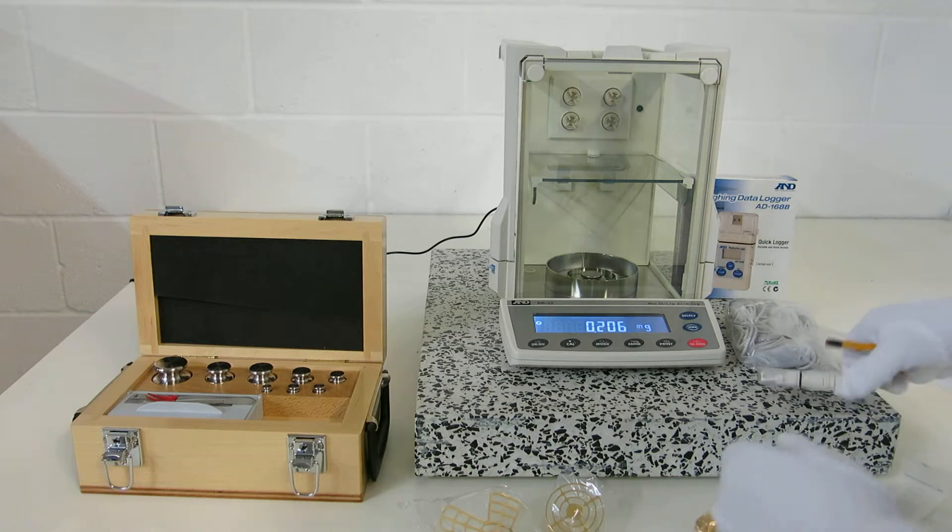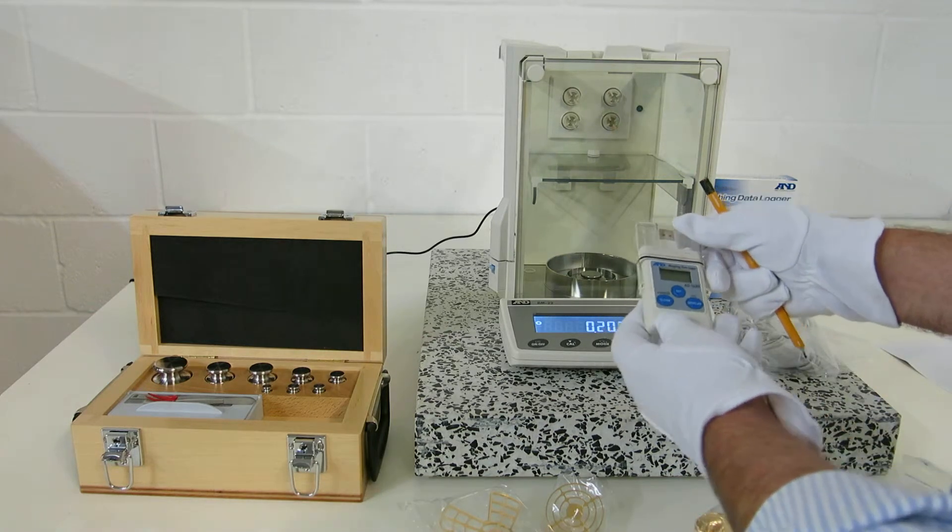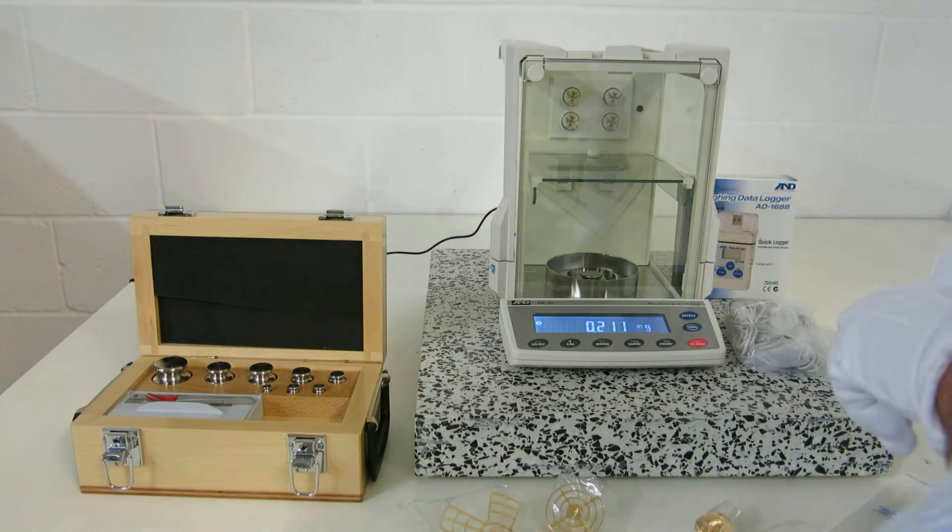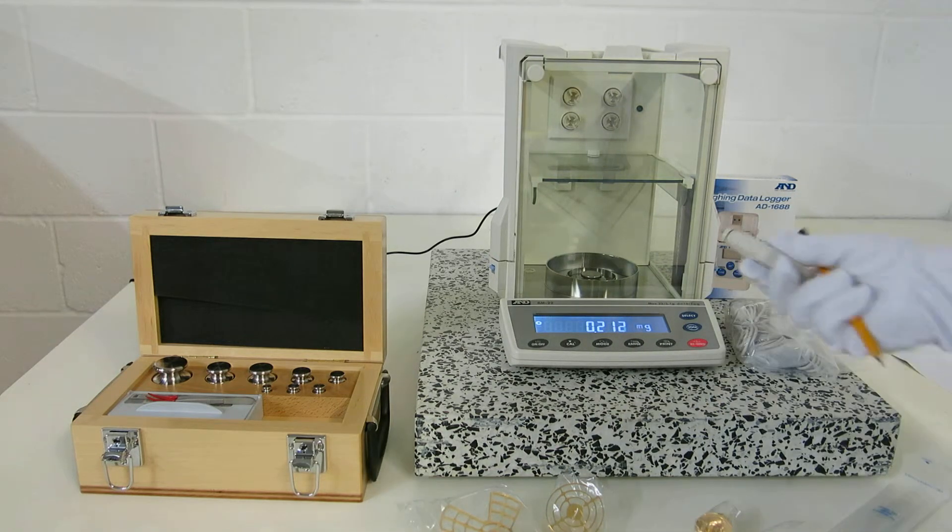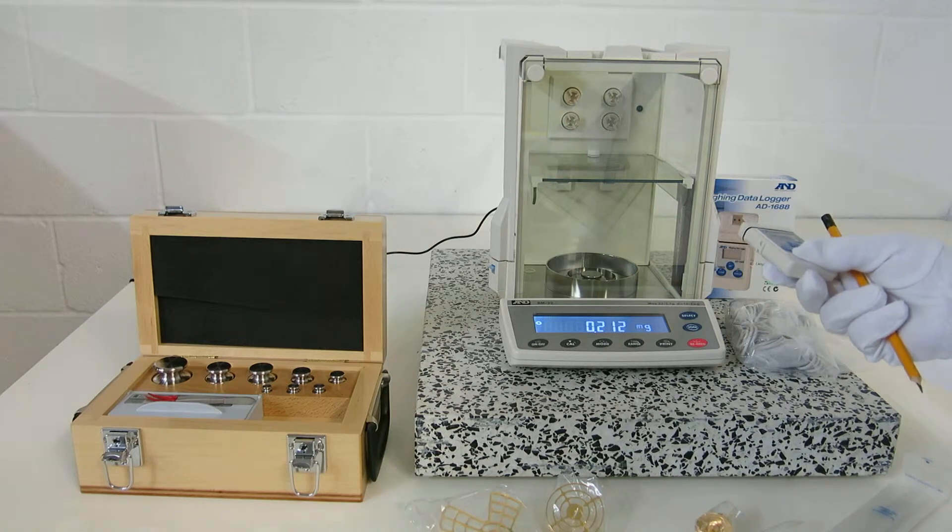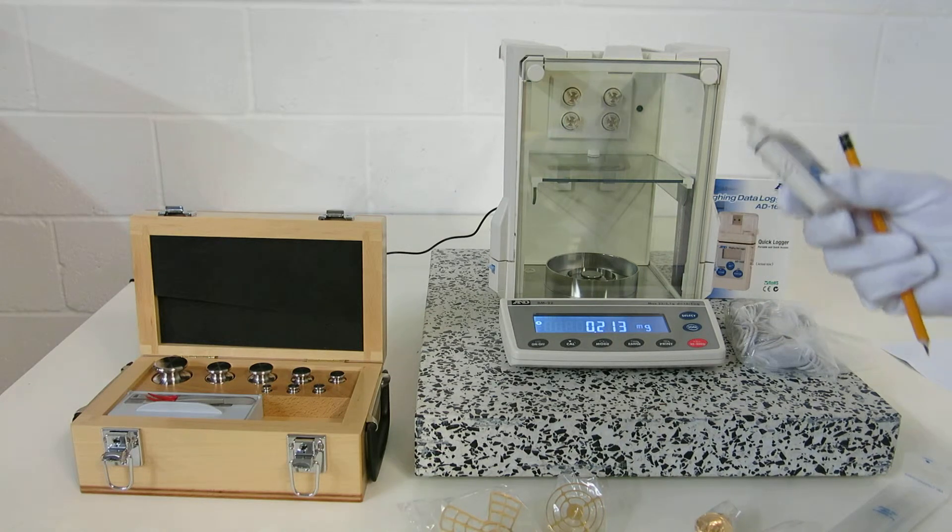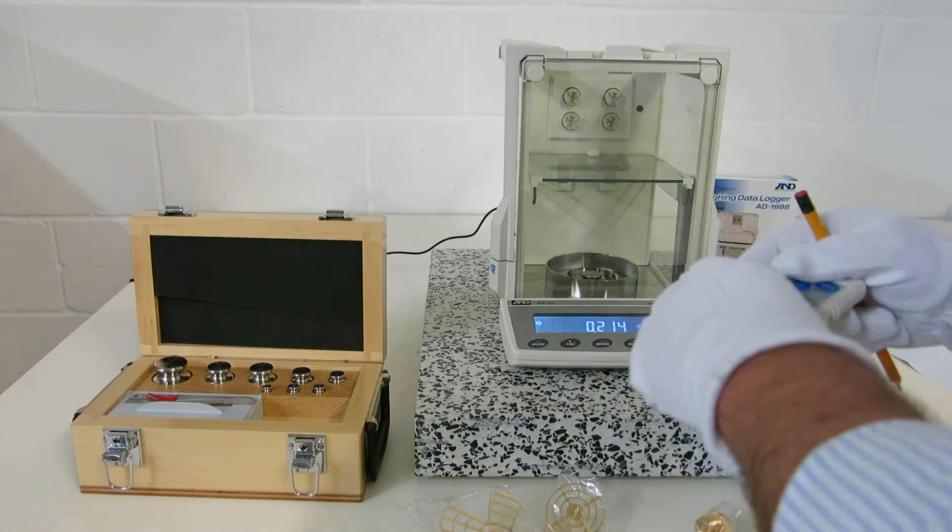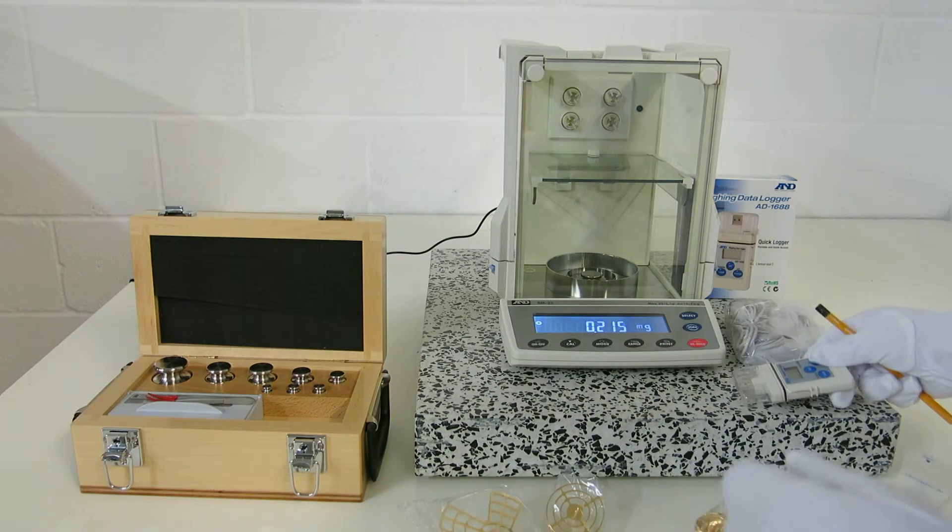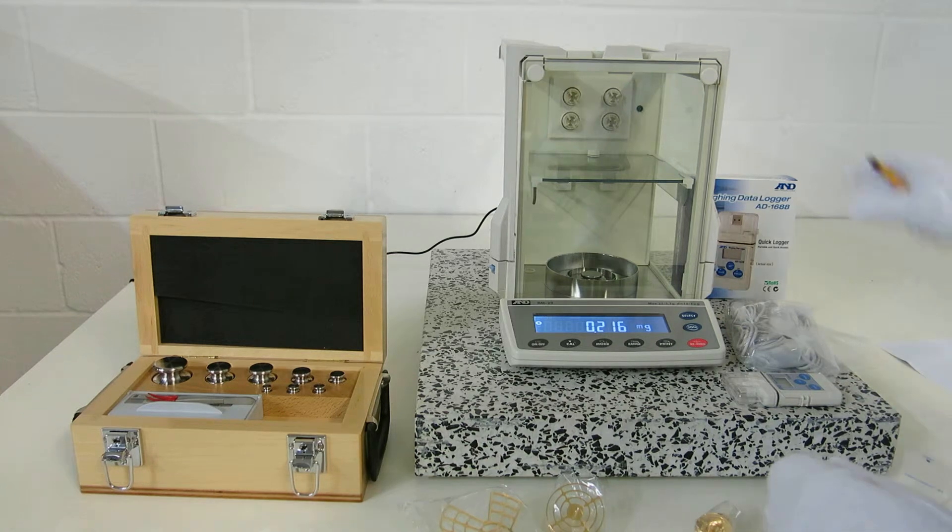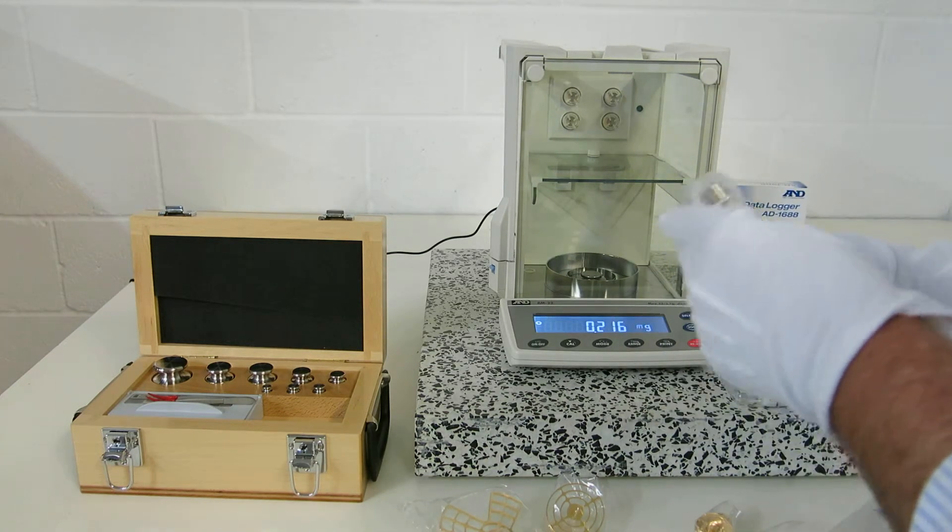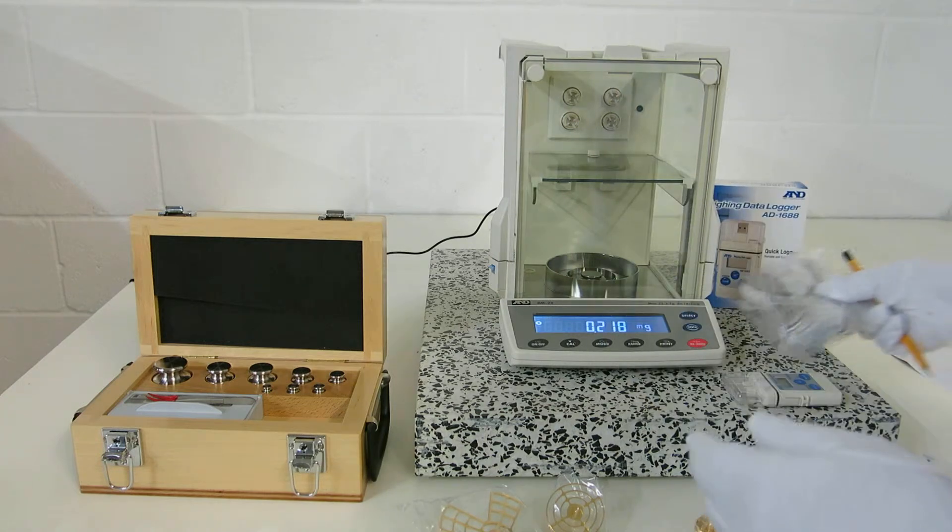What we've also got is this device here. This is a weighing data logger, an AD1688, and the beauty with this is it works on a USB interface. So you plug it straight into the back of the balance and then take it out of the balance, put it into your computer, and you can record all the information. It makes it so much easier and quicker for you to record your data. It comes in this packet, there's a variety of different connectors here for USB charging.